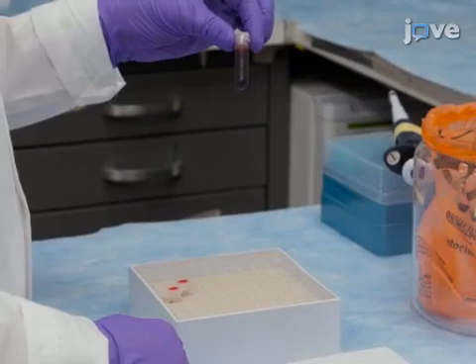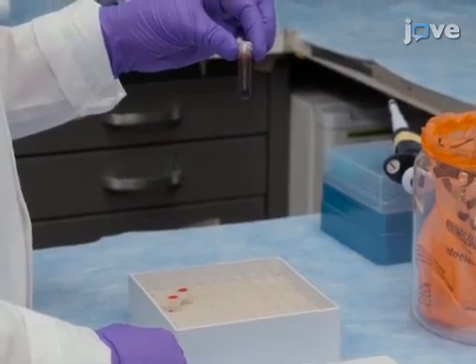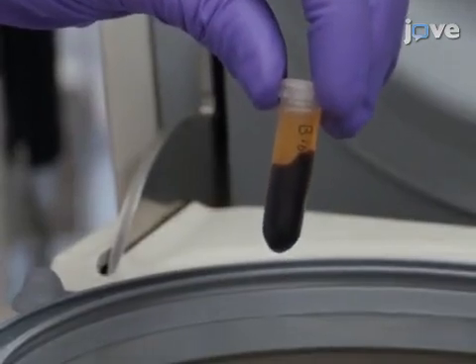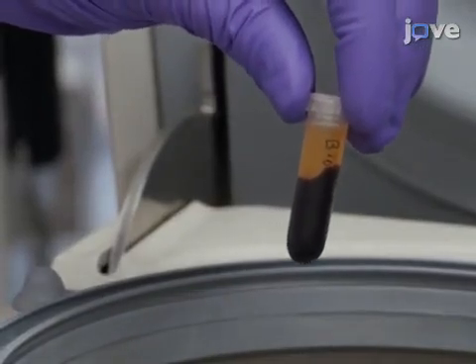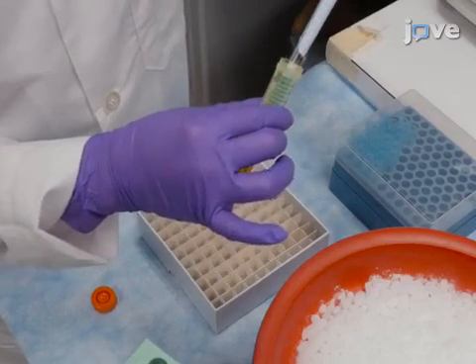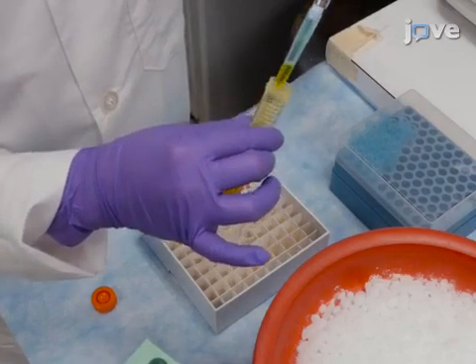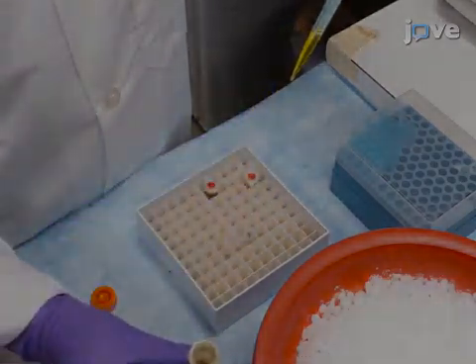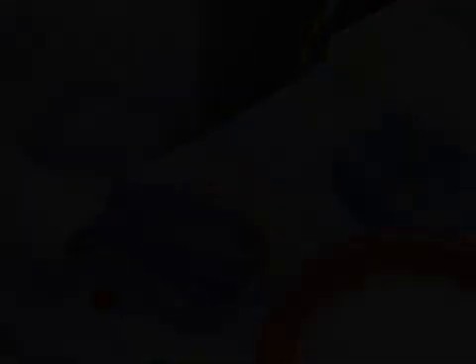The protocol can be used on many freshly obtained biological samples. In this case, freshly drawn blood was centrifuged to obtain a plasma sample for testing. It is very important to process blood or any biological samples containing large amounts of heme proteins, such as hemoglobin or myoglobin, as quickly as possible, because the heme proteins will react with the nitrite and destroy it. Now, in order to preserve most of the endogenous blood nitrite, immediately mix the plasma with the nitrite preserving solution.